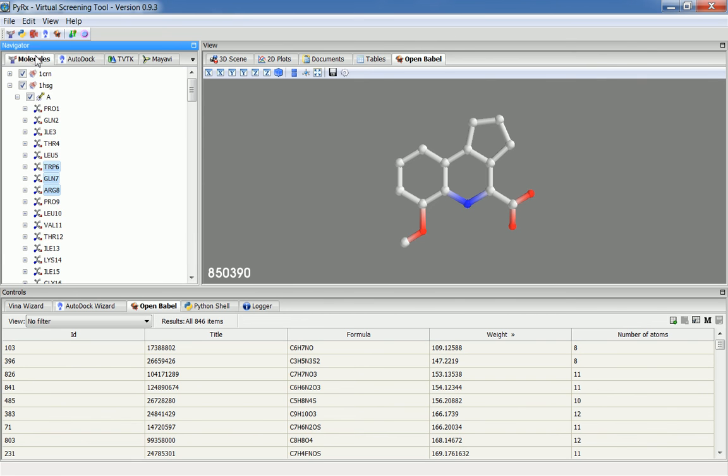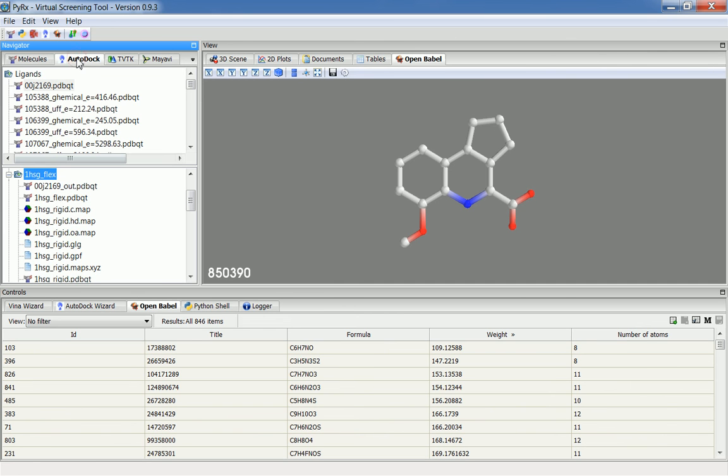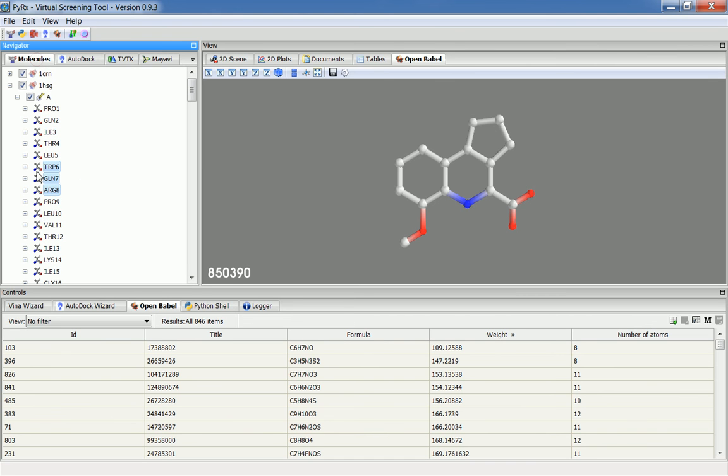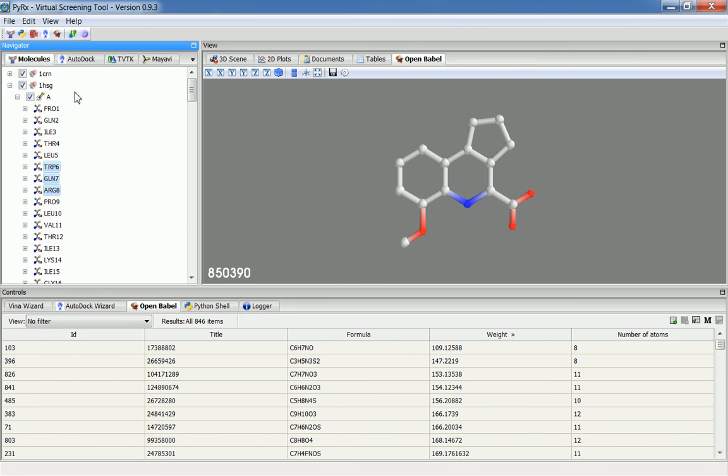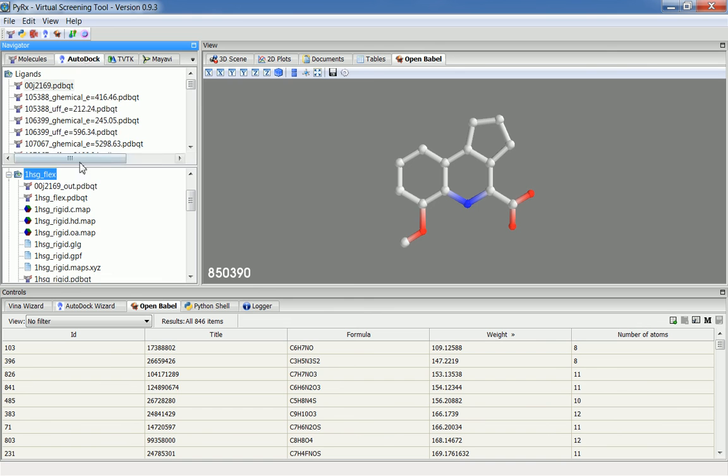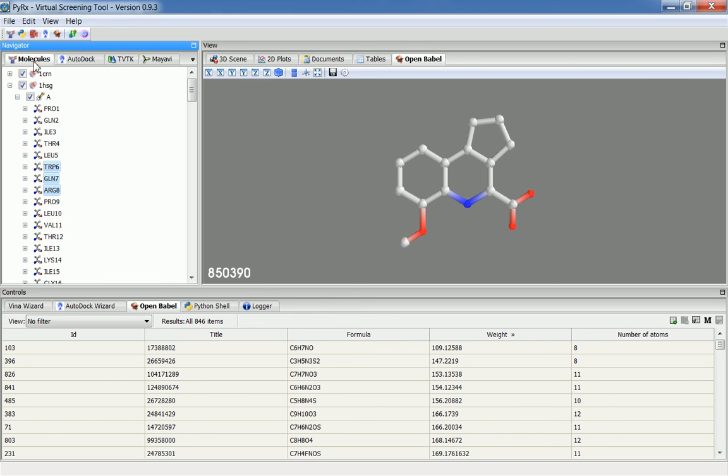The rigid part includes all the residues except these three residues here, and then it will include the flexible part that will include these flexible residues. The problem with large macromolecules was that it was giving a memory error. This fix now makes a flexible part for each residue individually and then combines it into one flexible PDBQT file.